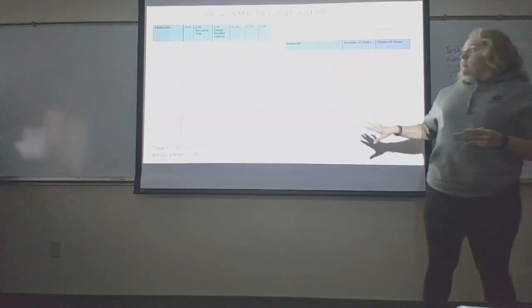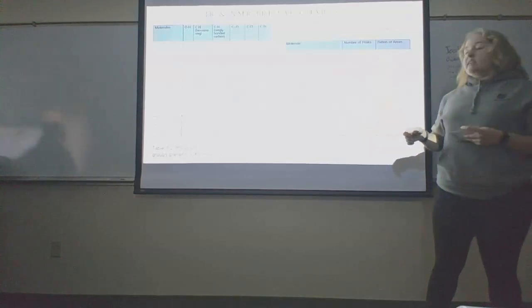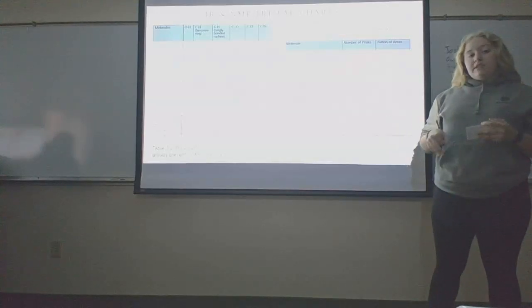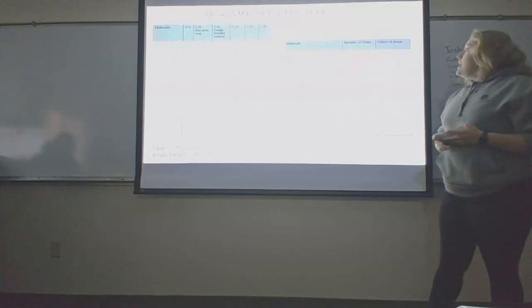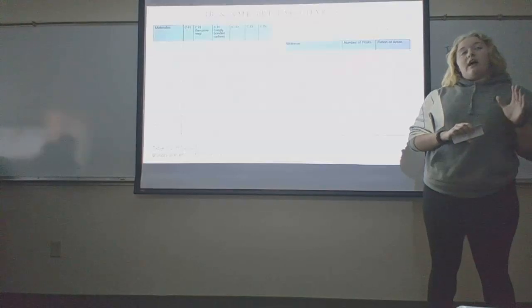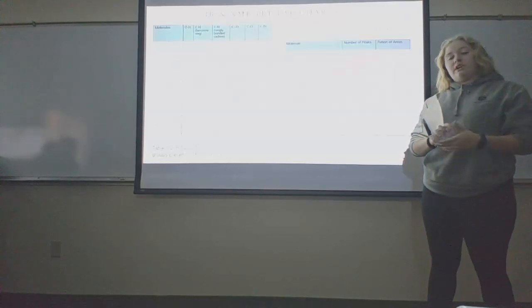For the NMR evaluation, once again, all of the molecules that had the potential to be present are listed. And then we evaluated their graphs to see the number of peaks, which once again correlates with the number of hydrogens present in each of those molecules. And then the ratio of the areas under each, which meant roughly how frequent or the amount of each of those hydrogen groups.